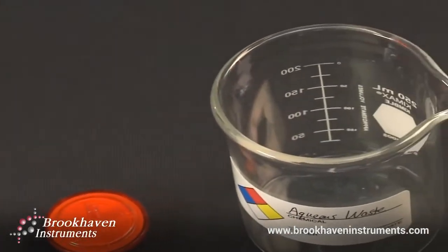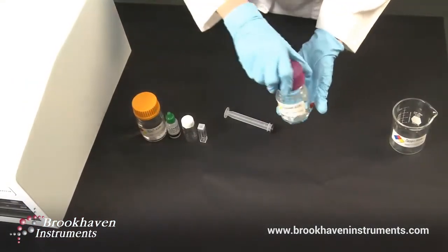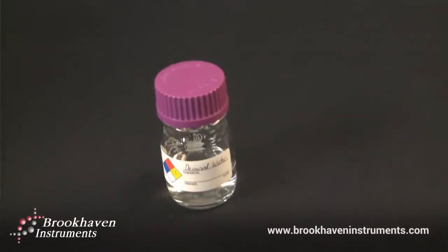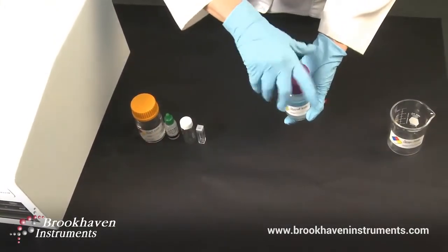Use a 0.1 micron aqueous filter. Next, pass about 20 milliliters of deionized water through the filter to remove any particles left on the filter during manufacture.